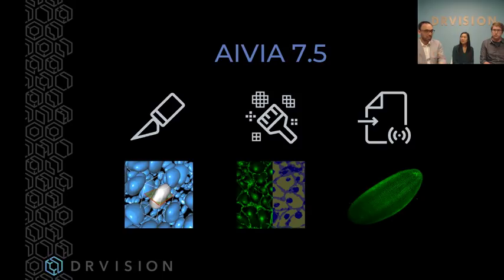And then for single files, for a whole imaging session like the SLD, we have also created special support, especially for the SLD, where there is only a single file on disk, and that file is being dynamically changed. So Aivia knows how it changes, we've programmed it to know, and we can update the renderer based on the new information that is being generated and put into those single files.